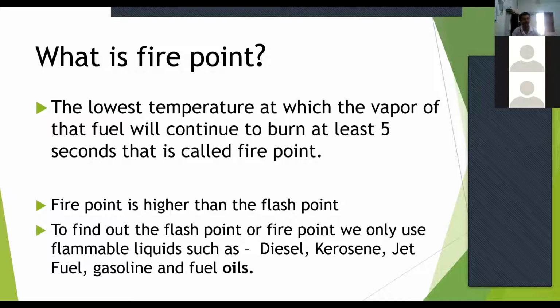We use one apparatus, and using that apparatus we can derive both. But in your practical, we are going to find out only the flash point, because that is very important. The flash point is much lower than the fire point.